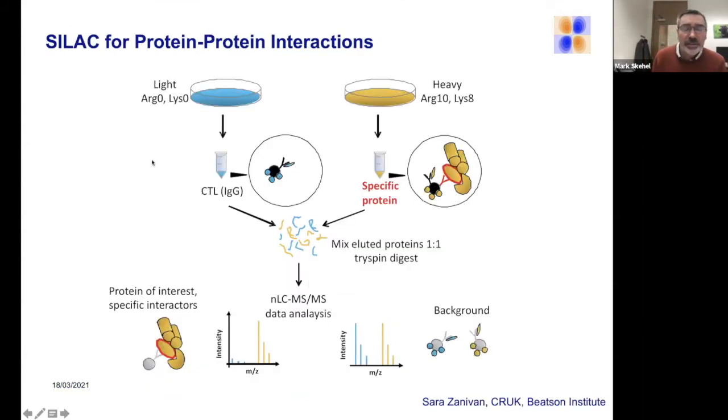And one application they're particularly keen on over at the mitochondrial biology unit is using SILAC for everything. They use it for their protein-protein interactions, where if you label with isotopes and then pull down, non-specific interactors are always going to be one-to-one in your background, and so you can look for specific interactors. That's one method of doing it.